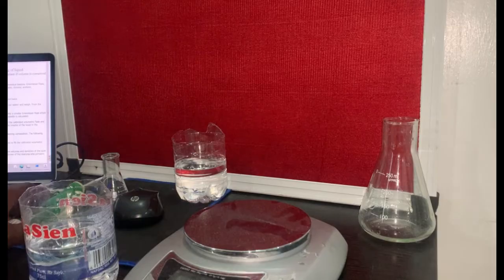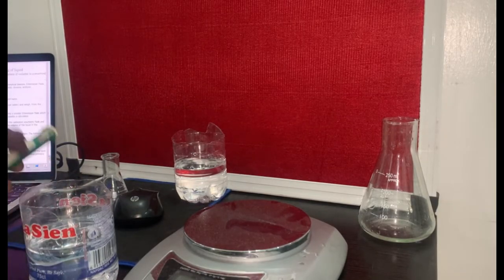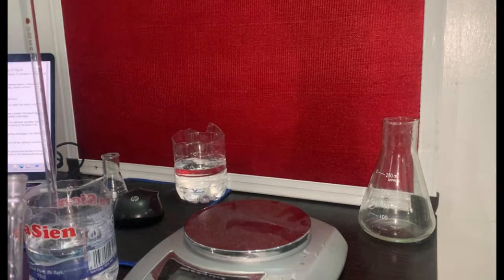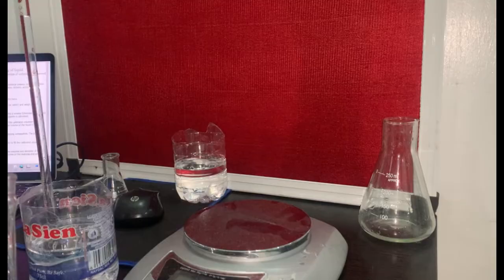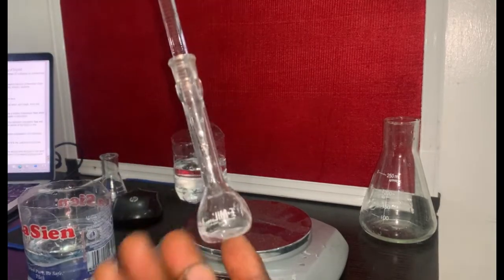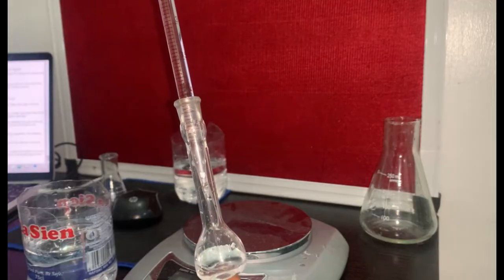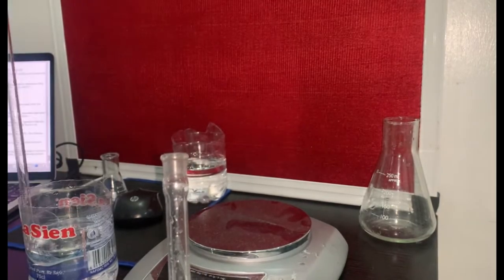Or they might decide to give you alcohol, which is ethanol. So we are using ethanol here. I'll open this. Since I already did the first one, I'll come here. I'll empty it into the flask. I'll come here, pick another one.